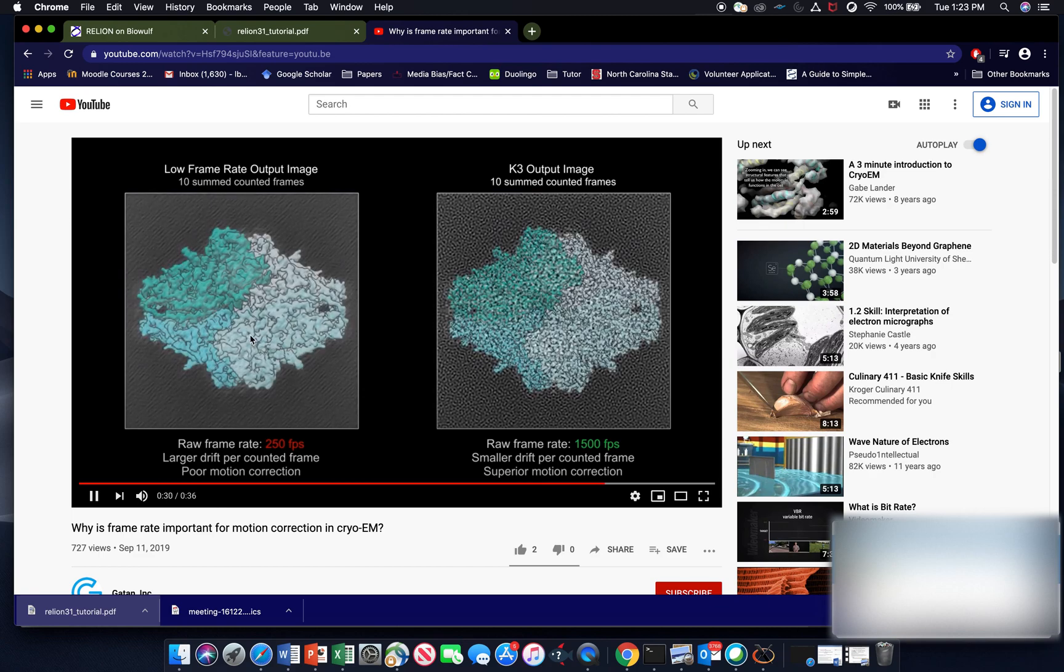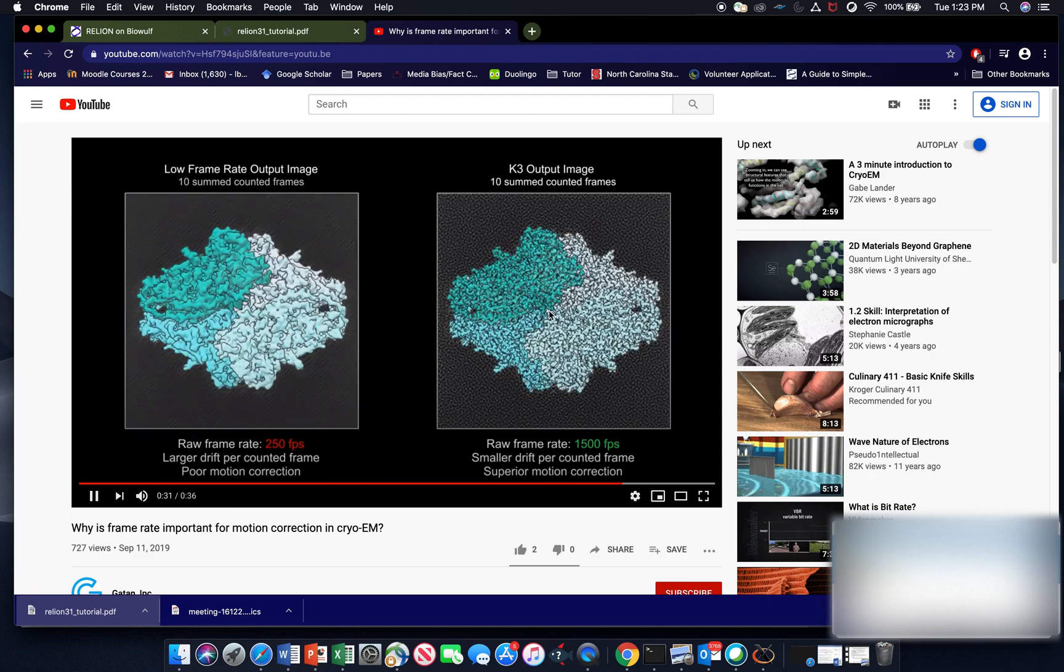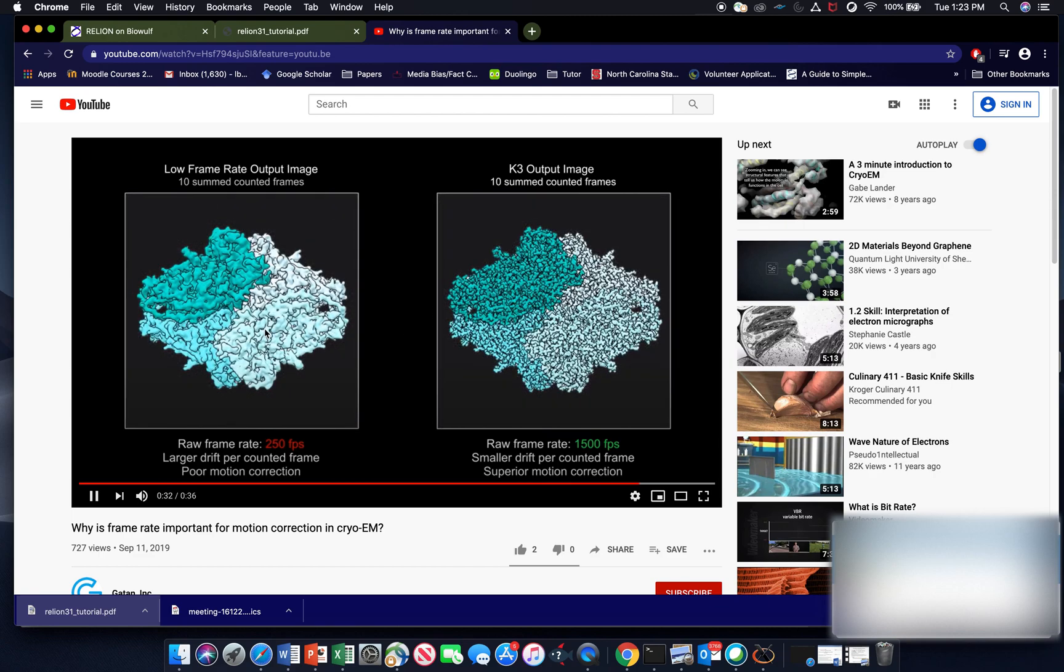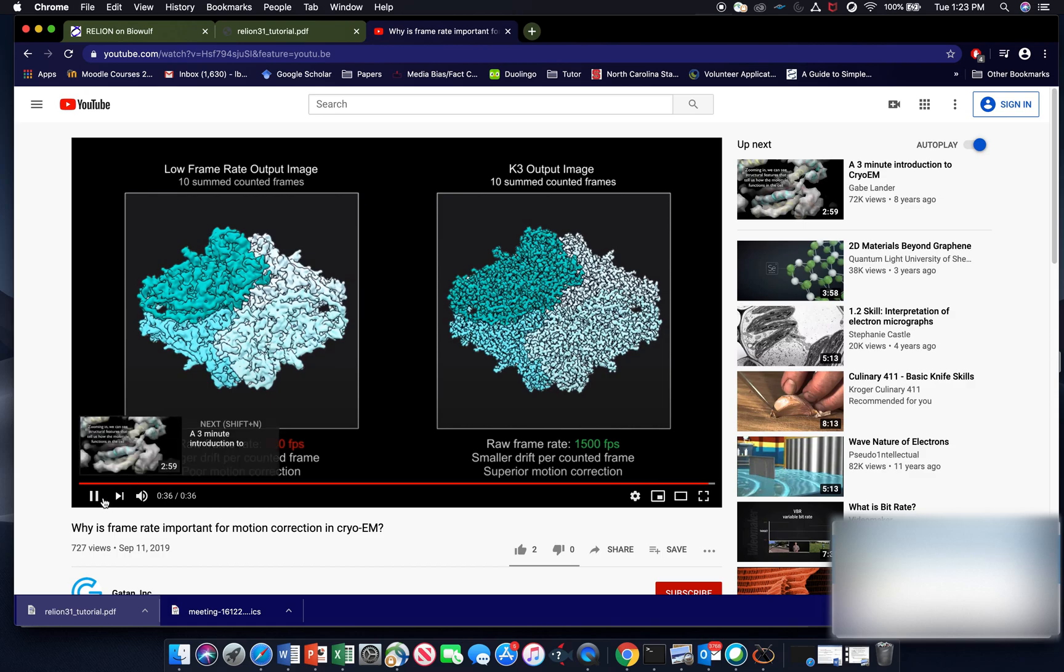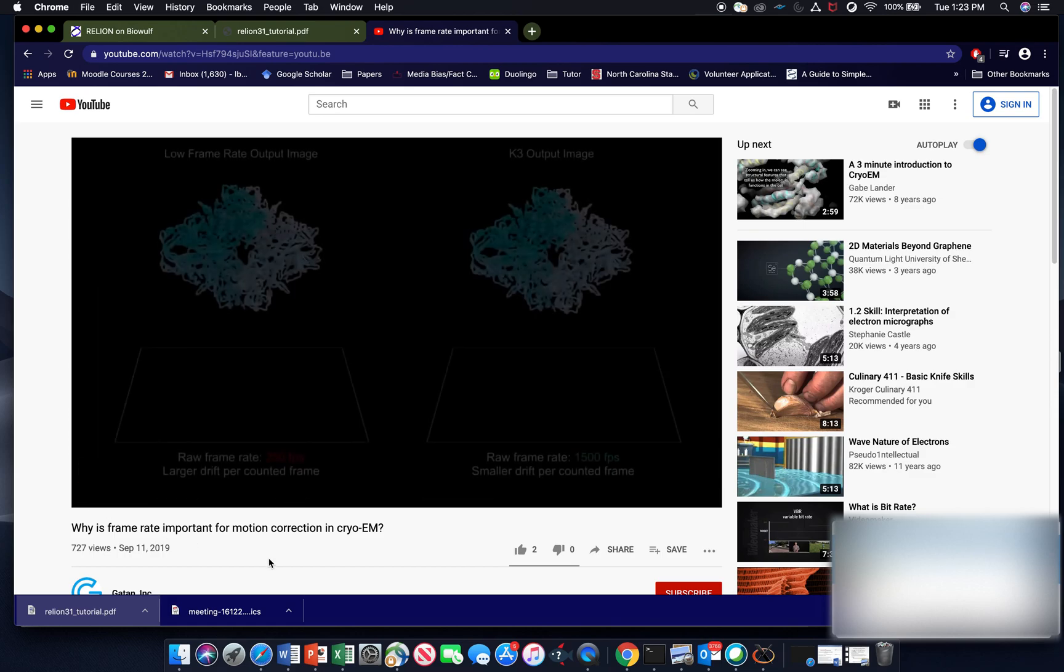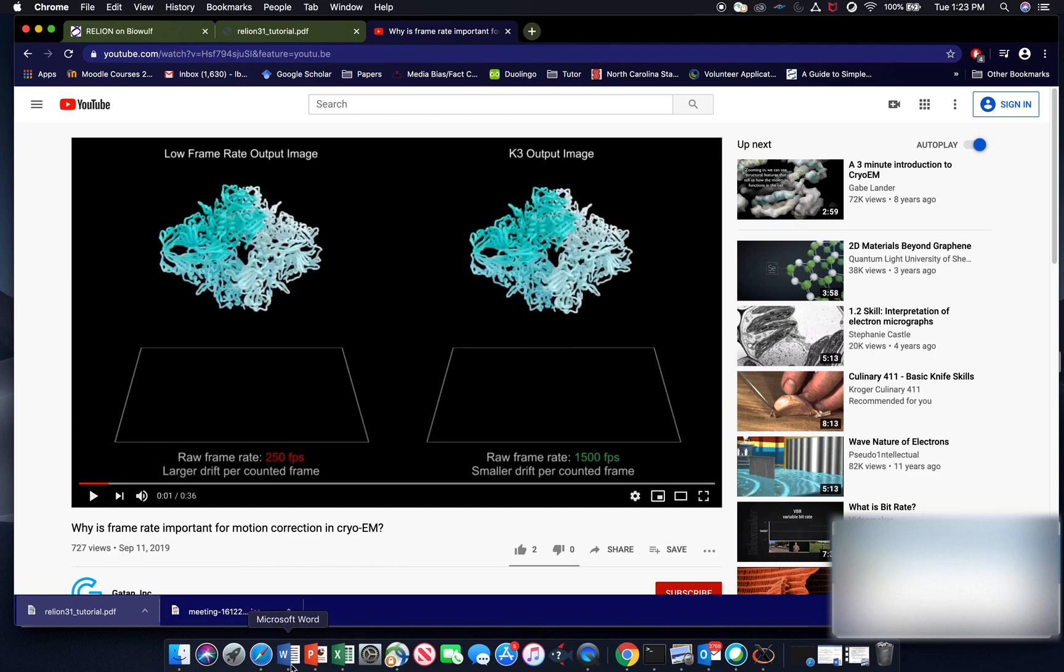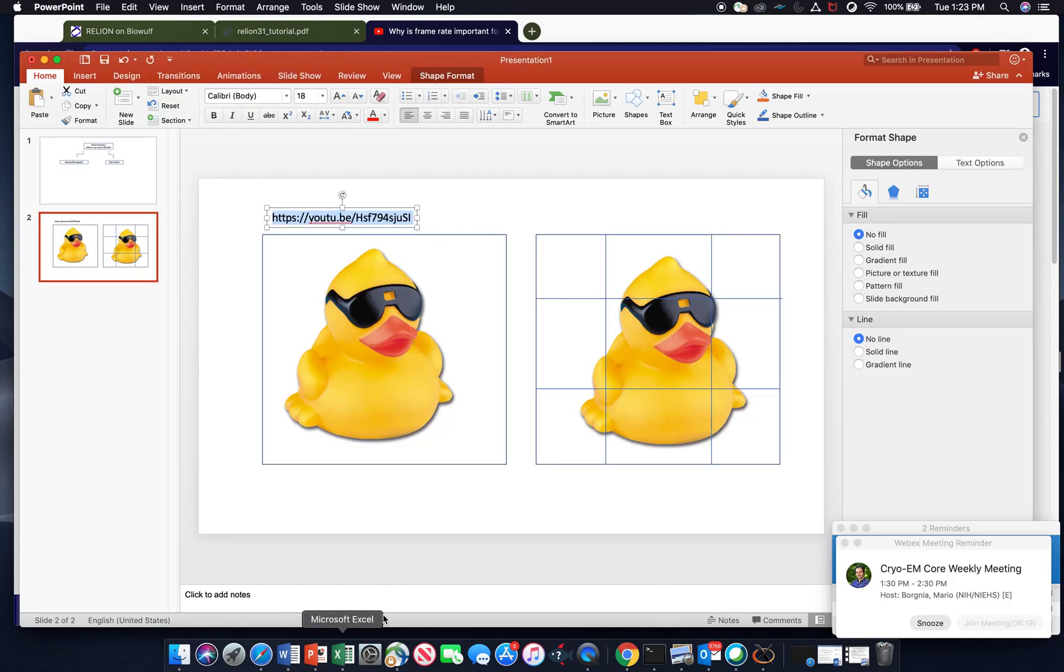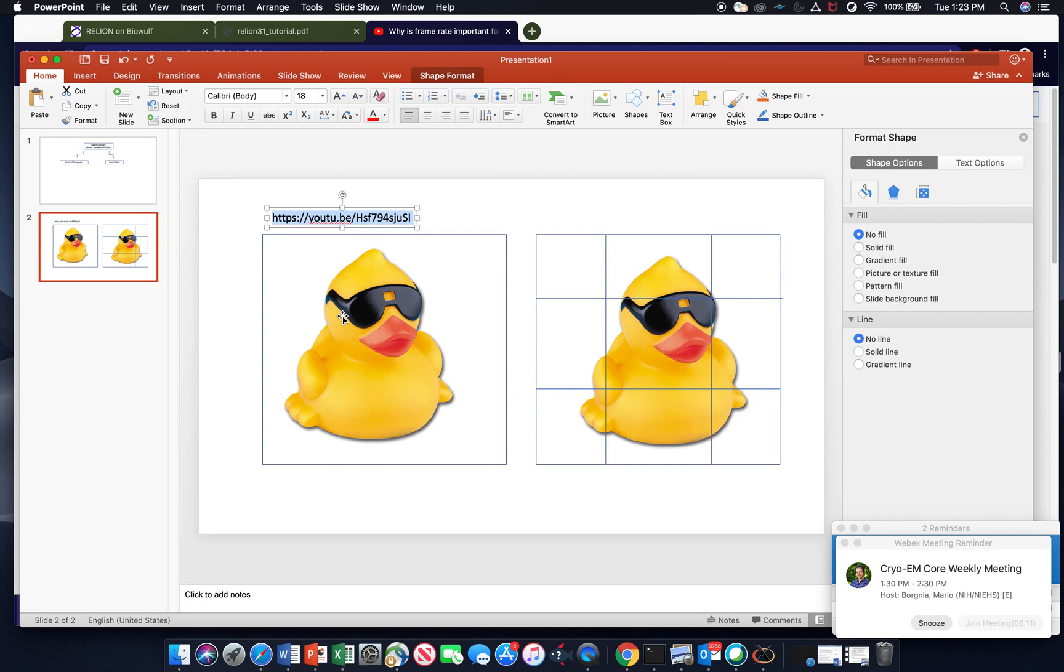And you can see the effect of that on the resolution of these two particles. So what you're doing when you motion correct, at least initially, is you're determining the number of tiles you want to break your images into.